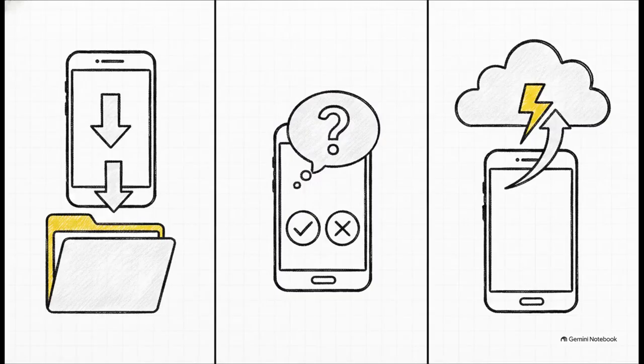You basically have 3 distinct workflow choices for submitting to the predictor. If it's set to off, the app simply saves the scan locally to your phone. If it's set to prompt, it'll pause after every single scan and ask you, hey, do you want to submit this for prediction? And if you set it to auto, it seamlessly sends everything directly to the predictor without asking.